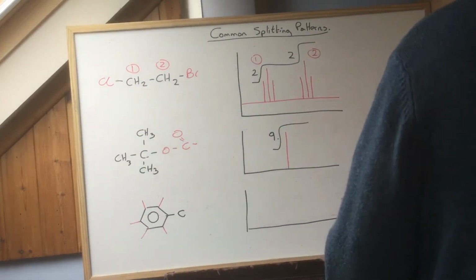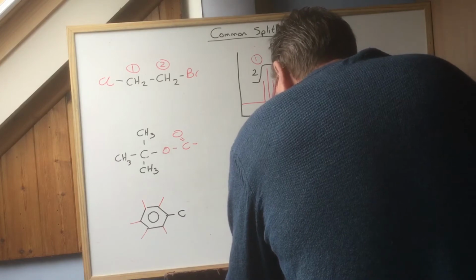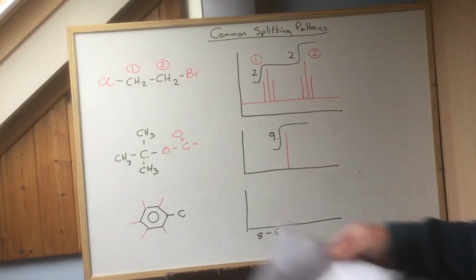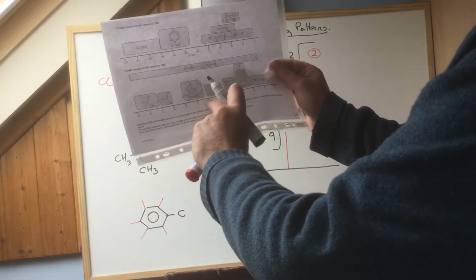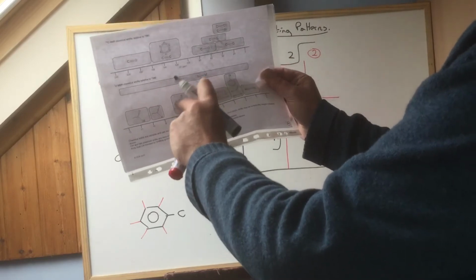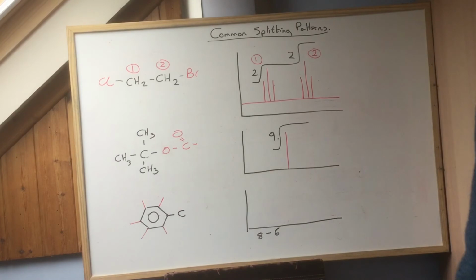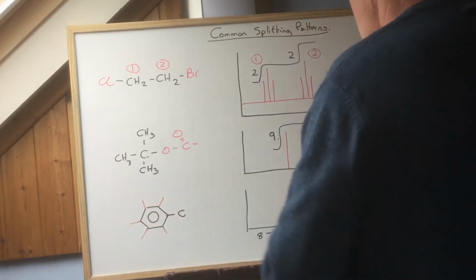And although I wasn't going to talk about chemical shifts, if you've got an aromatic ring, you're always looking for something in the region of about 6 to 8. Okay? If you look at this, 6 to 8, yeah, 6 to 8. That sort of thing going on. Right, now, what do you look for? So you look for a region 6 to 8, and then these protons interfere. These split with each other in a characteristic way.